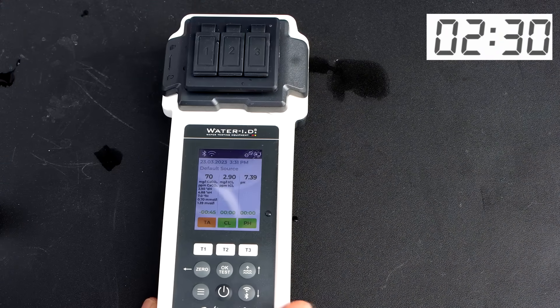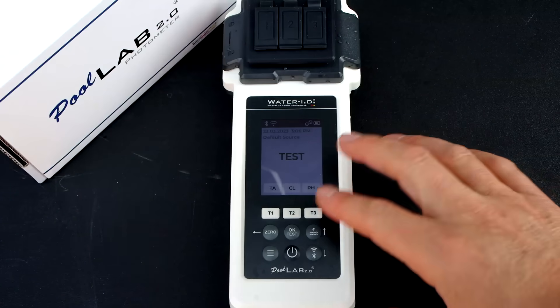I'll do a total chlorine test while I still have the chlorine sample in the chamber. You want to use the DPD3 tablet for this. You can see the total chlorine is coming in at 2.9.